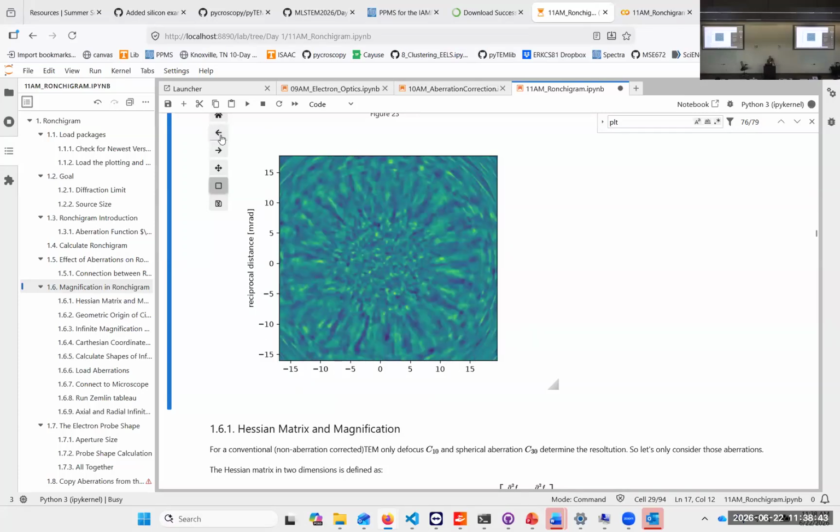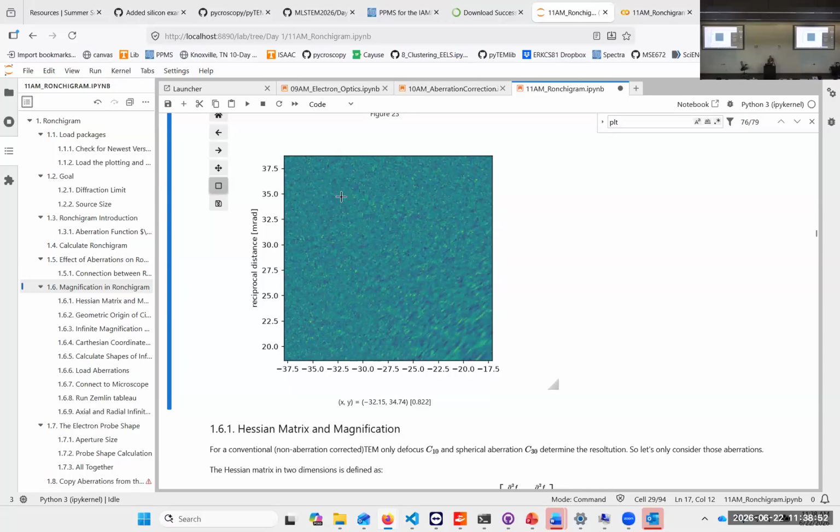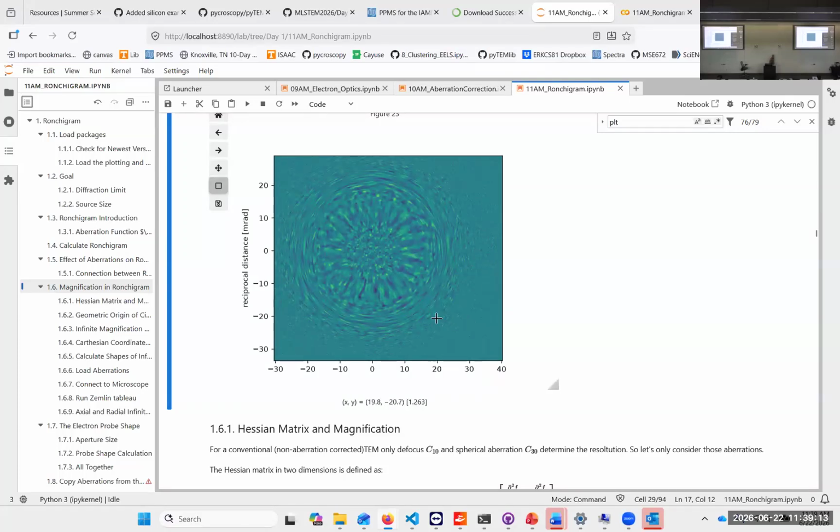And if we look on the outside, this is also an image. And this image has a very weird behavior, and that is that the magnification changes as you go away from the center. So you have basically two kinds of centers here. And in the defocused one, you get this wheel-like structure. And that's what we want to look at in the next part here.